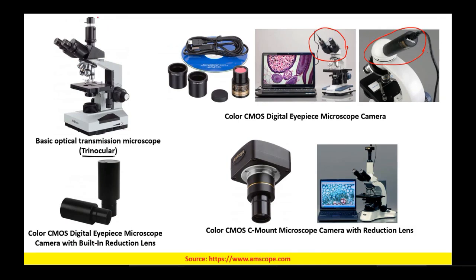This trinocular port is basically used for imaging purpose, so this is dedicated for imaging. Now what is the importance of this? When you are doing your projects in your next semester, and you are working on some microscopic techniques, you would be interested in putting up good quality micrographs. This trinocular microscope allows you to take micrographs. The cost of the trinocular microscope is higher than the binocular one, which is again higher than the monocular one.